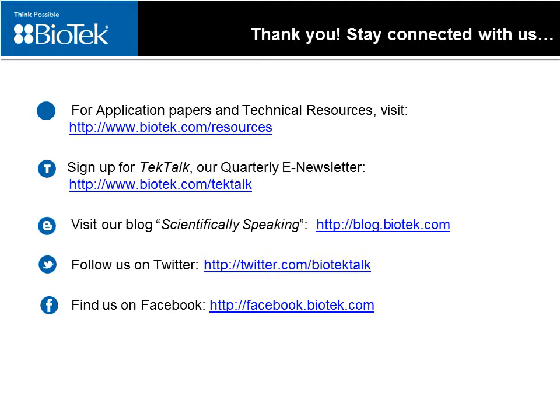We have a question about high contrast bright field being used for a variety of cell lines, and this is an important question. High contrast bright field imaging really provides detailed imaging for all cell types. Some cell types certainly behave better as far as spreading out and being accurately counted. We've tested this on a variety of cells, and they've all worked quite well.